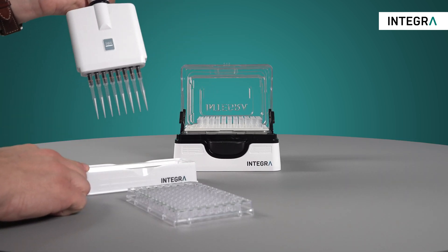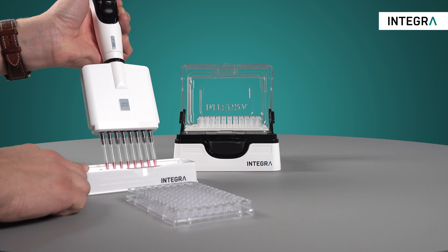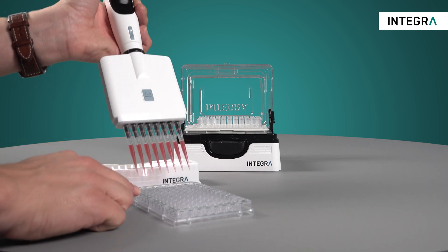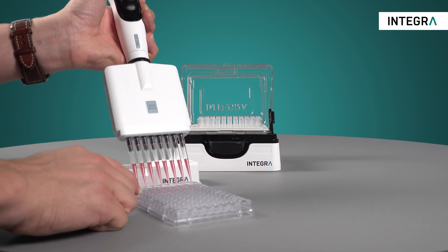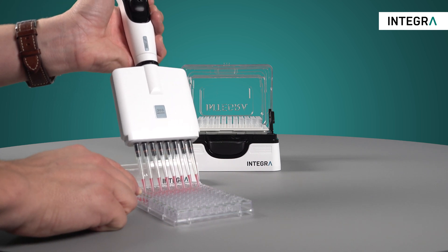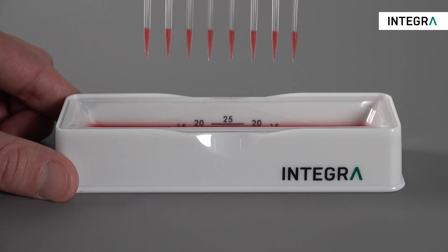It's always good practice to use a pre and post dispense anytime you're working in repeat dispense mode with an electronic pipette. These are simply waste dispenses. They should be discarded or placed back in the source container because they're typically the least accurate of all dispenses.